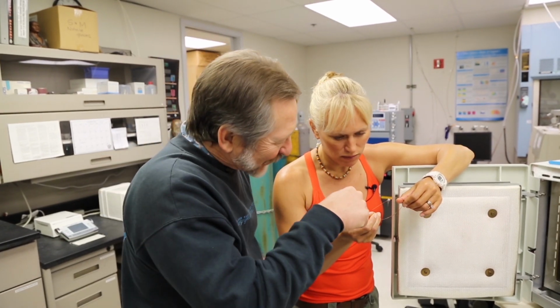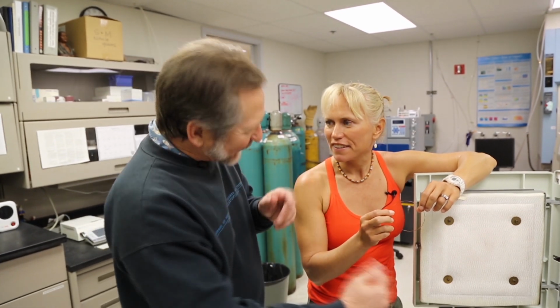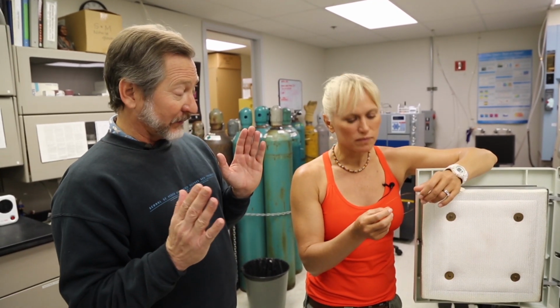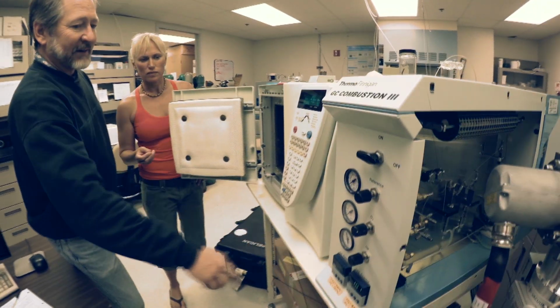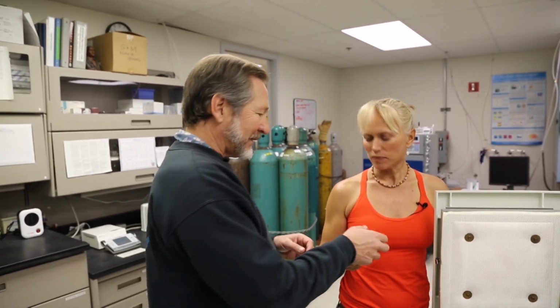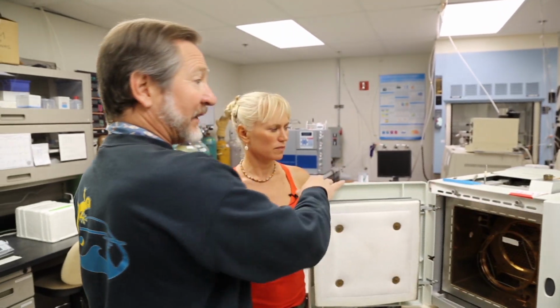So the amino acids are sliding through this tube, and the little amino acids slide through there more rapidly than the big ones. And it gives us our way to separate those. They end up in this little tiny combustion oven. And that combustion oven is at 980 degrees. And at 980 degrees in that oven, it converts that amino acid to carbon dioxide and nitrogen gas, which then travels through more of those tubes, but not as an amino acid, as a gas.